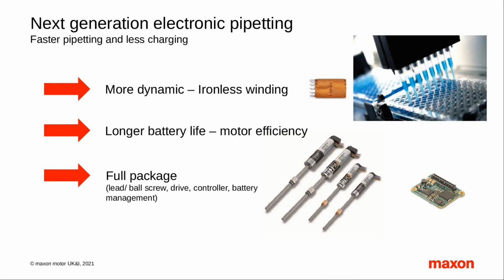So pipetting, we've all seen on telly people holding a pipette where they're filling up the sample trays. They press a button and the machine will pick up a small quantity of fluid and dose it into the sample trays.